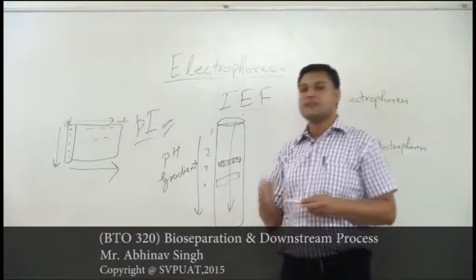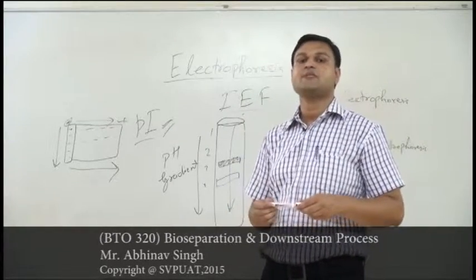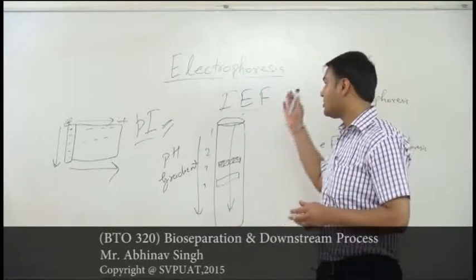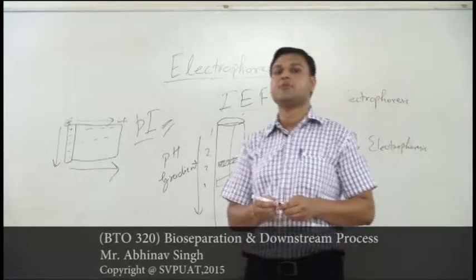The problem is that this technique is very good for analysis purposes, but it is not very helpful for industrial purification practices. So this is all about the electrophoresis. Next comes how a nucleic acid is going to be separated.